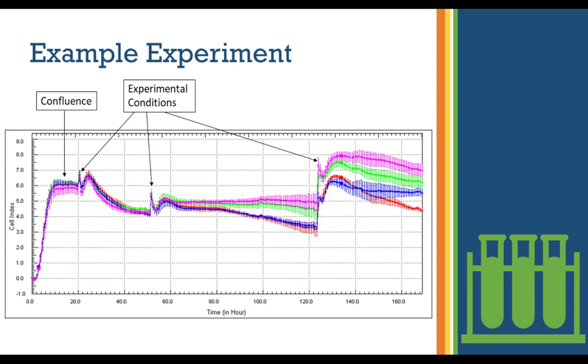So here is an example of one of my models. This is just an example of an experiment. Again, it's real time. It's a super nice feature that I could put the cells in, let them grow over time, go home and sleep, and come back and work on it the next day.